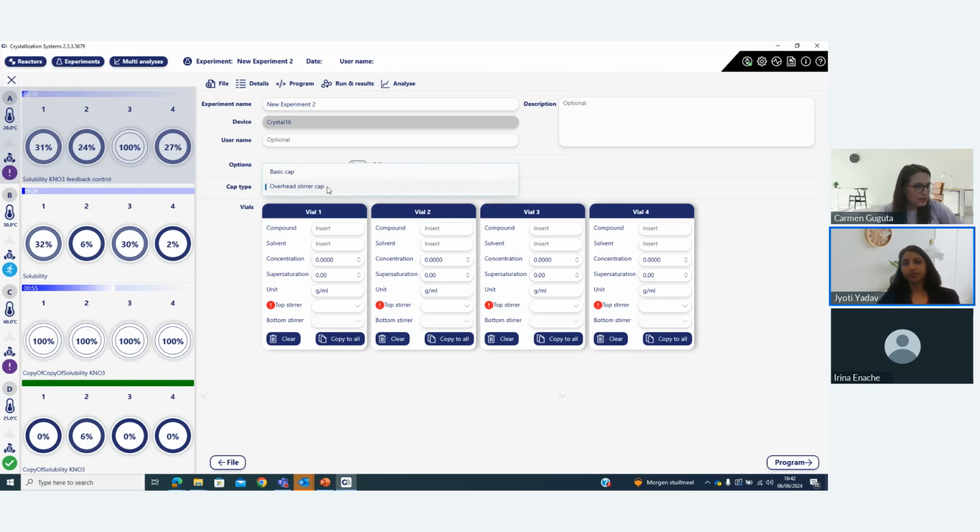Yes. And what is the recommended number of points for a good solubility curve? So the minimum is 4, and maximum you can use as many as you want, but I think 5 or 6 would be good. But with the 4, I think it gives sufficiently good data to present your solubility. And it also depends on the compound a lot.